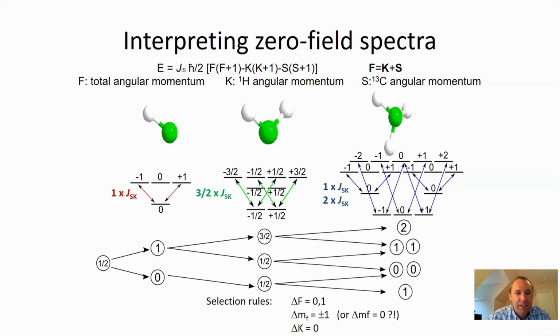Can I also ask, probably in some non-zero field, transitions within, let's say, triplets also become allowed and observable, right? So yes, correct. And those are very low frequency components then in the spectrum. And we'll talk about those a little bit as well.